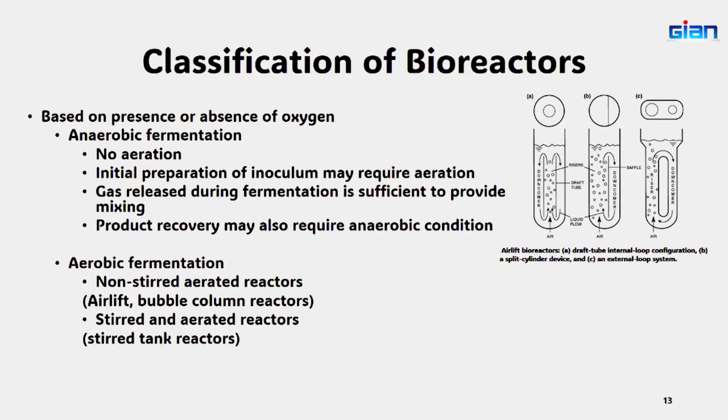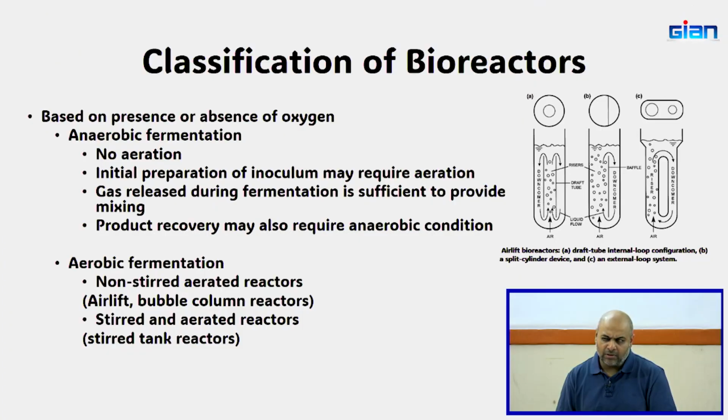As it moves up, it is going to mix the nutrients with the cell culture. The product recovery may also require anaerobic conditions. Majority of the time, if I remember correctly, in the lab we provide anaerobic condition by purging with nitrogen.